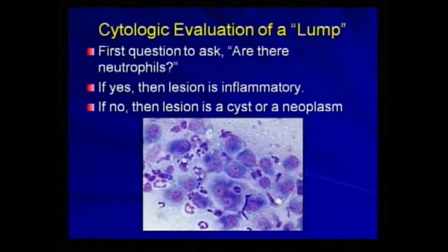Well, those are just some basic concepts about stains and staining and when to interpret and when not to interpret. And remember, all of that will be reflected in that first sentence, which is usually quite simple, and will say something like, this is an adequately stained, adequately cellular fine needle aspirate. And that sums it all up.